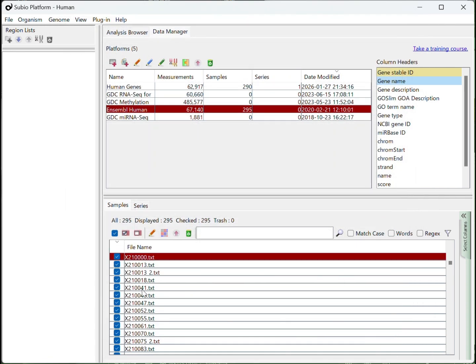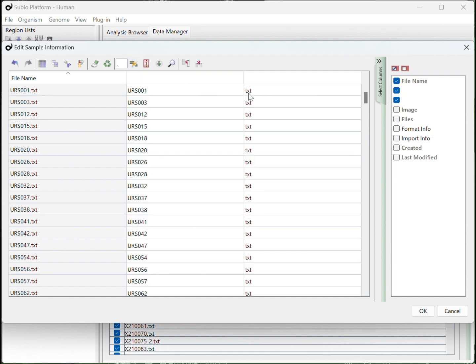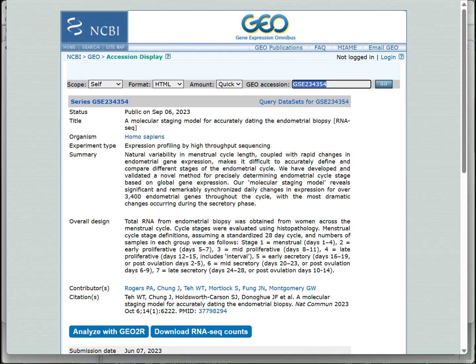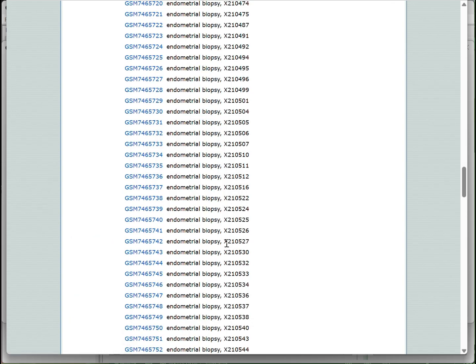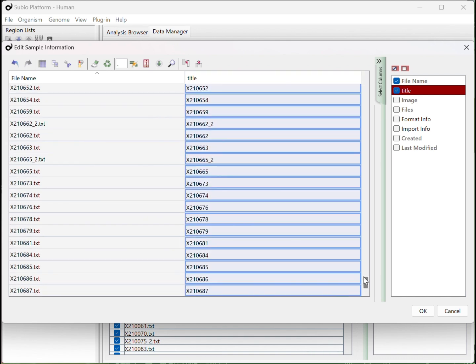Samples are labeled with the authors' names. Remove .txt to extract the genuine names. The sample titles of GSM records have endometrial biopsy before the names. So, edit the names with Excel to fit the sample titles.